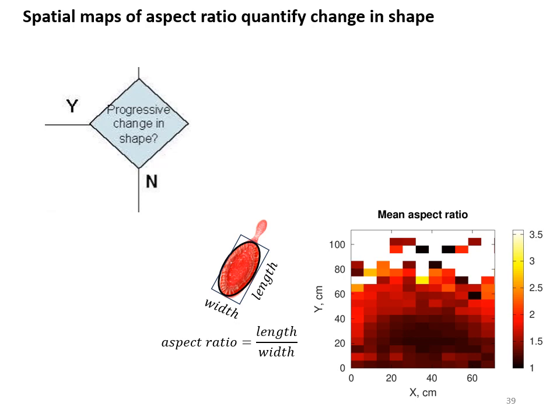If you have a very narrow gap between the black and the yellow, or the light red, then it's a very sudden change in shape. But if everything is the same color, then you have no progressive change in shape, but at least it's measured. So that's all for classification.